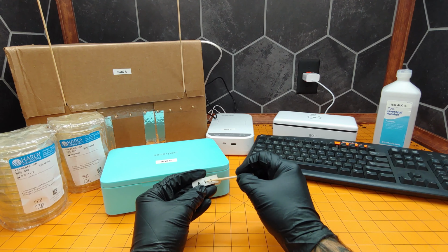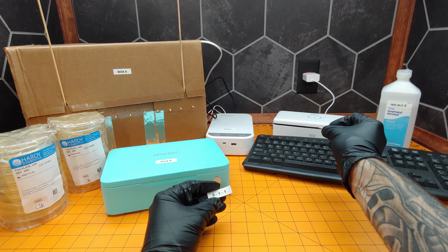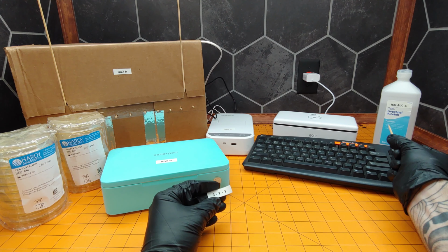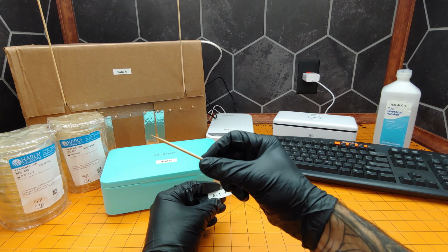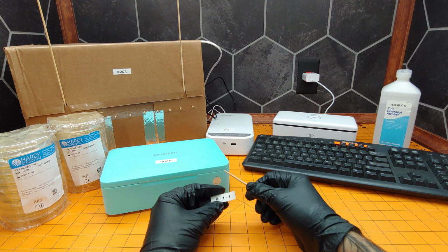We'll do that with each of these boxes or sterilization methods, since we're going to be using 70% isopropyl for our box E or sterilization method E, and that will give us 4, 8, 12, 16, but we'll only be doing 1 each of the isopropyl because I'd like to leave 2 untouched as controls. And that will give us 4, 8, 12, 16, 17, 18, and 2 controls, 20 plates total in the incubator. We'll give that 24 hours at human body temperature, around 37 degrees Celsius, and using our microscope, see how much bacteria has grown.